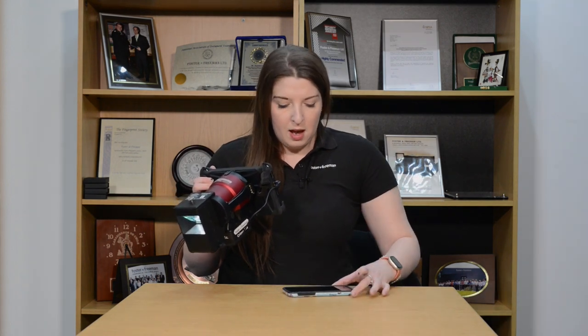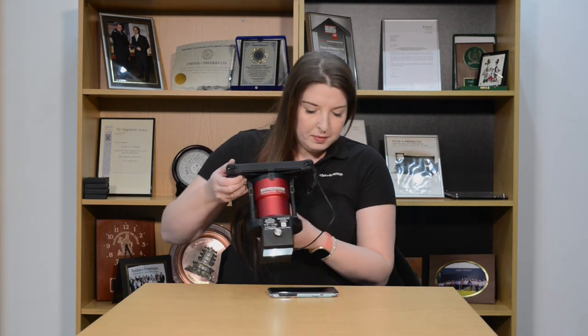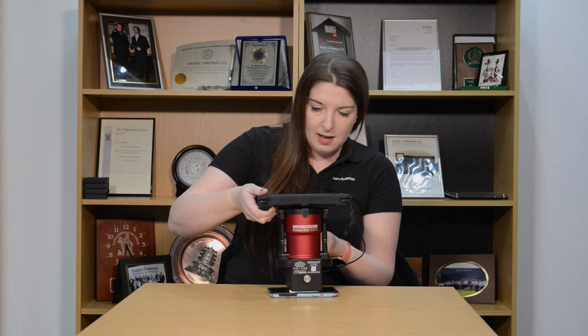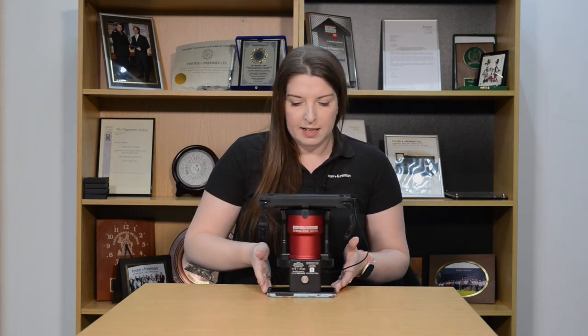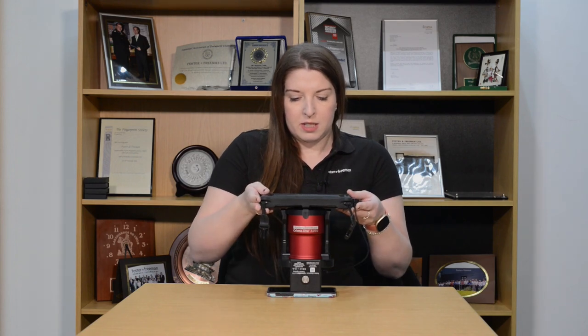I've got an example here today. This is just a standard smartphone, and this just has some latent finger marks on the screen. What I'm going to do is place our Crimelight Auto with the coaxial attachment directly onto the item.